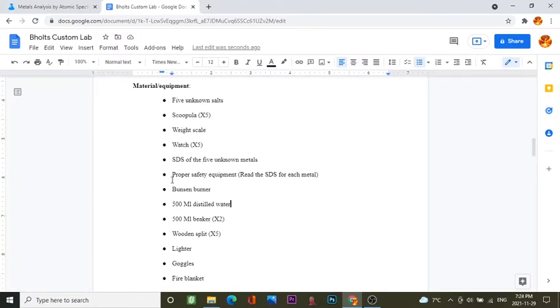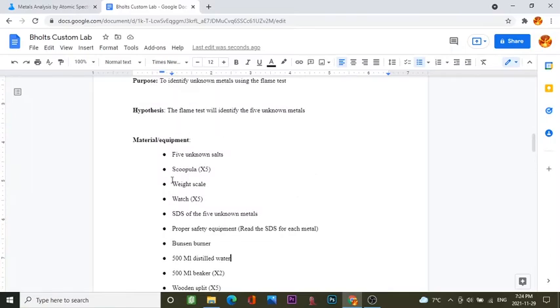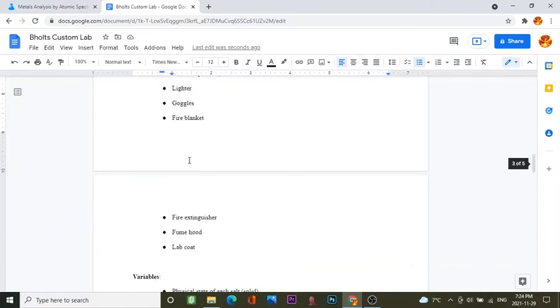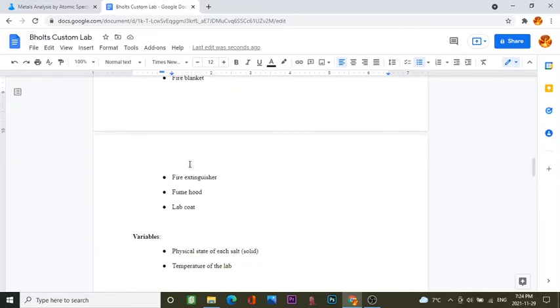Alrighty, so materials and equipment. We'll be having the 5 unknown salts, 5 scoopulas, as it's repetitive to clean a scoopula over 4 times, a weight scale, 5 watch glasses, the SDS sheets of the 5 unknown elements, the proper safety equipment to read the SDS sheets for each metal, a Bunsen burner, 500 milliliters of distilled water, 2 500 milliliter beakers, 5 wooden splints, a lighter, a set of goggles if you're doing it by yourself, a fire blanket, a fire extinguisher, a fume hood, and a lab coat for protection.